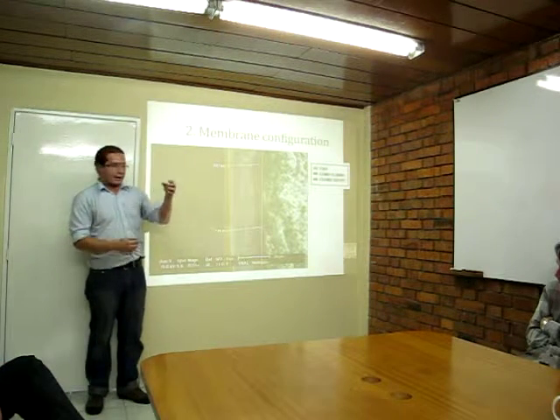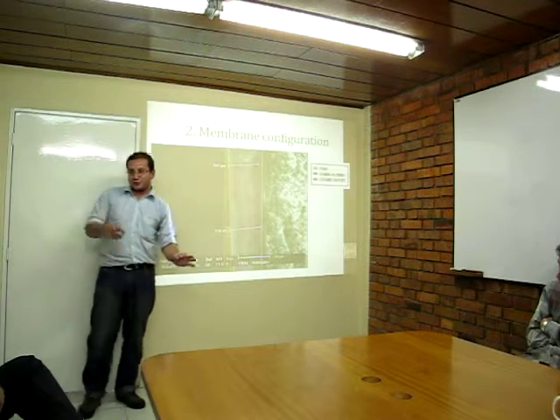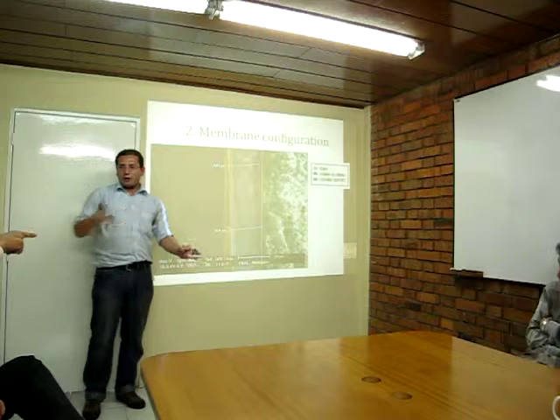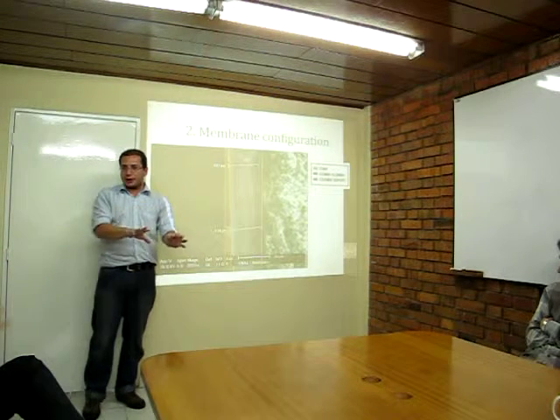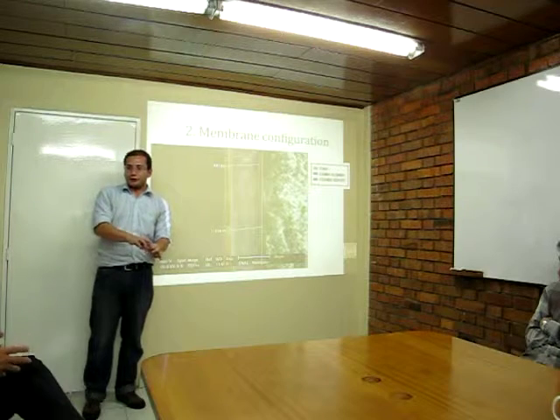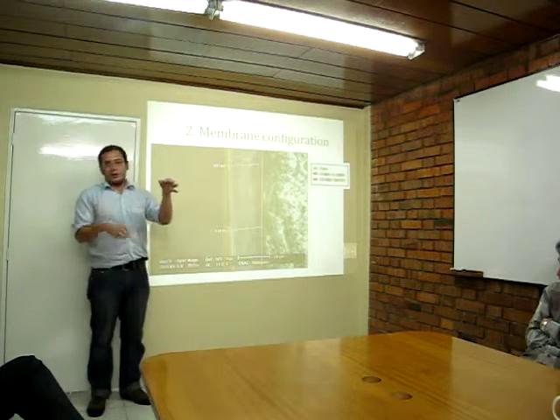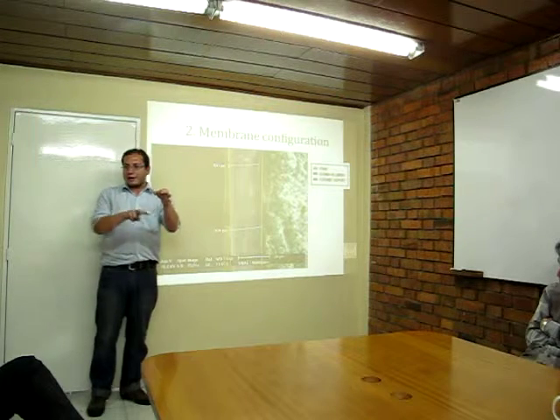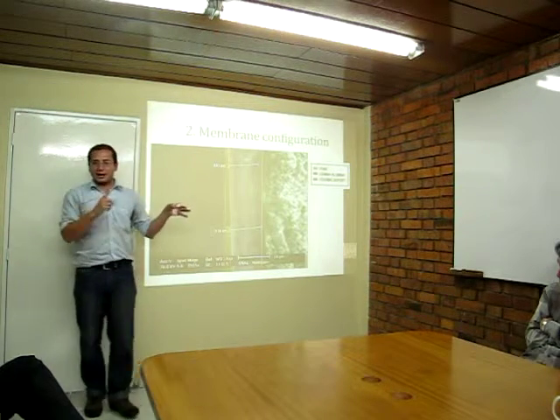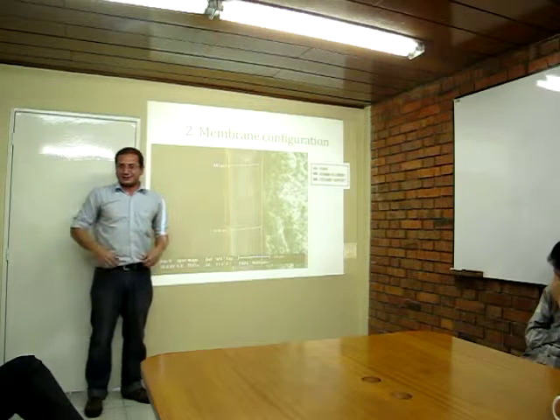You put the ceramic support into the solution of gamma alumina, only water and gamma alumina. You require to dry after that. You dry this layer and then you calcinate the gamma alumina.